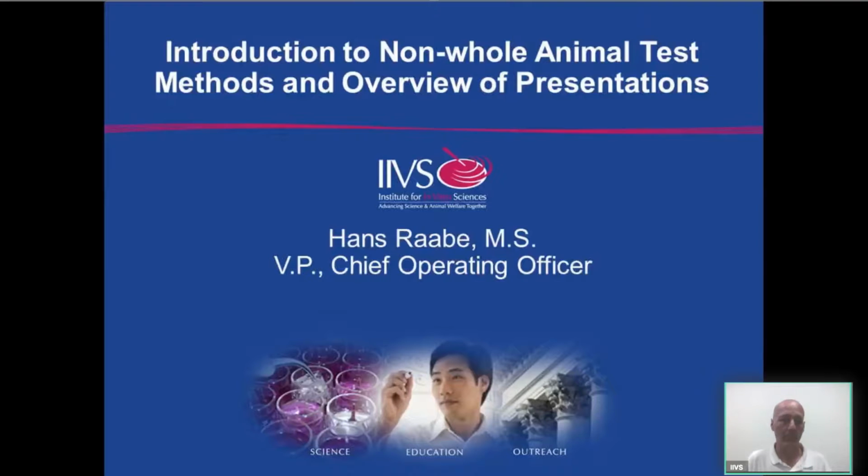My presentation here today will focus on an introduction to in vitro test methods, an overview of the types of test methodologies utilized from simple 2D cell systems through more complex three-dimensional tissue reconstructions and ex vivo tissues. I will provide an overview of some of the applications and limitations for those test methods. And this will give us a backdrop then for the subsequent presentations from my colleagues.